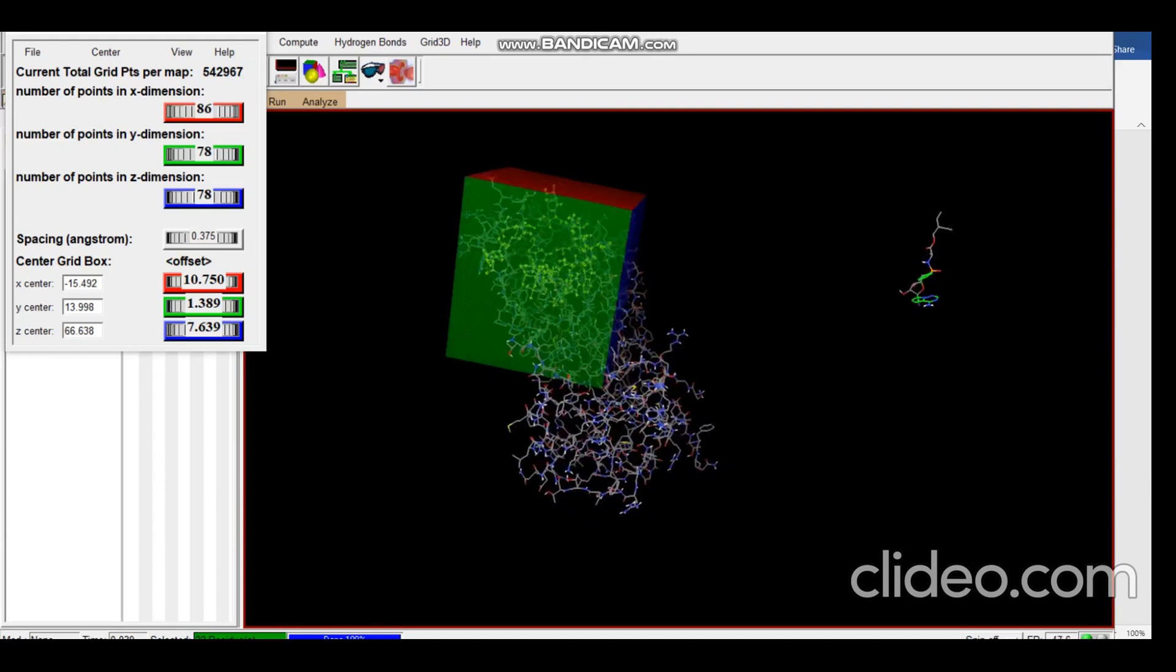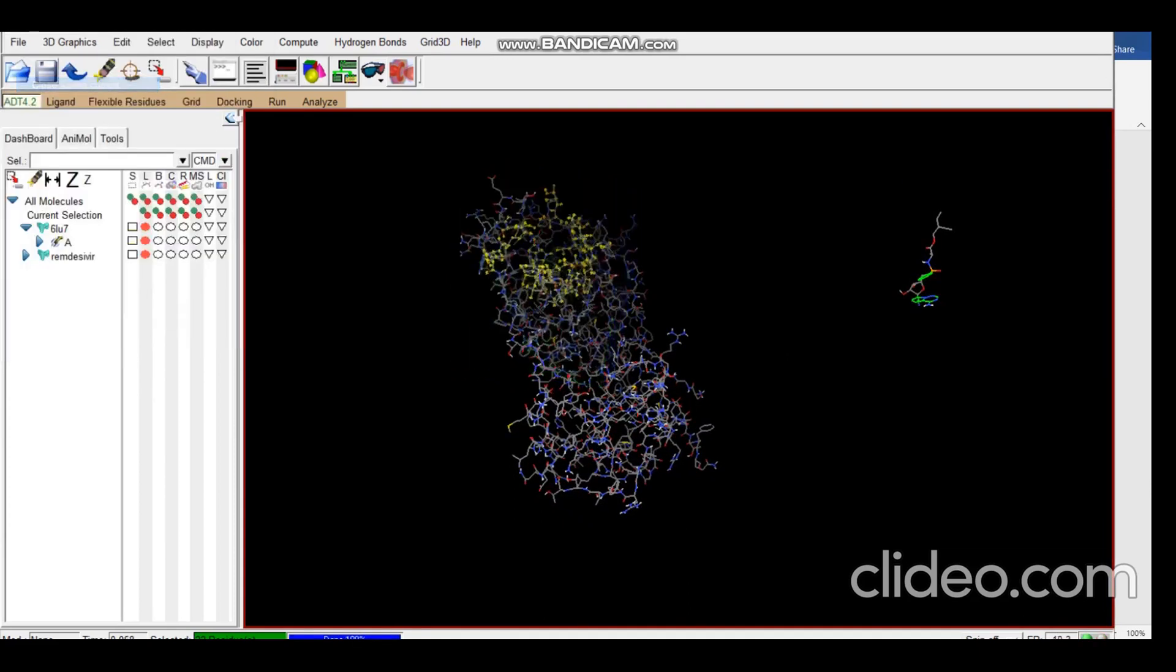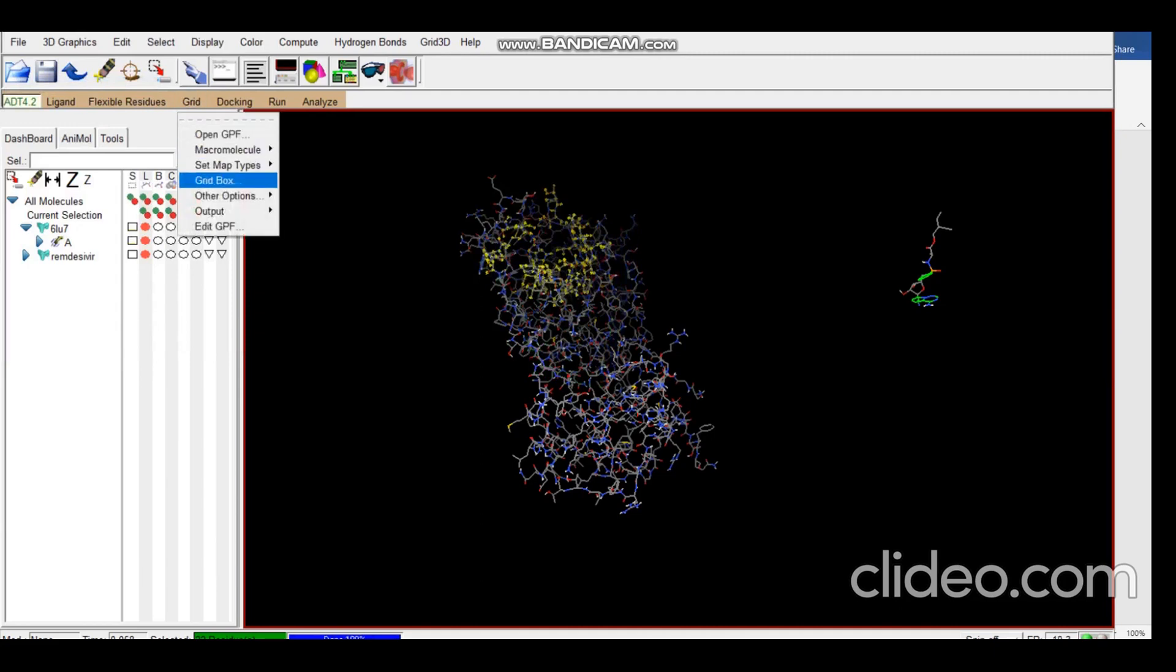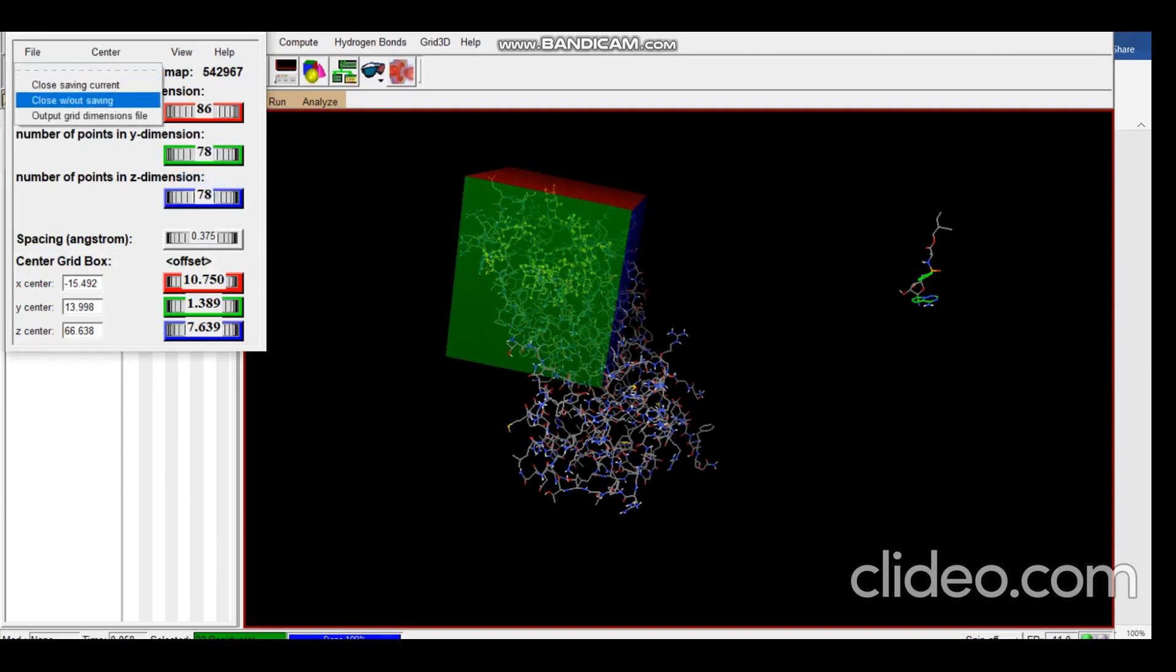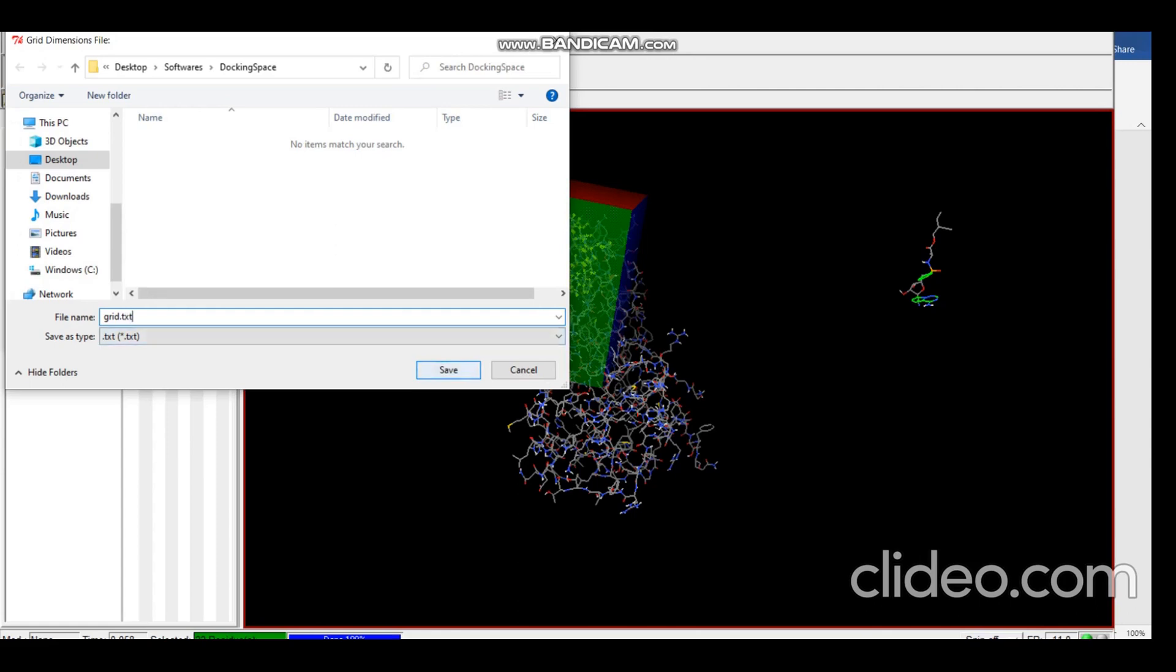So yes, let's go ahead. We will go to File and Close Saving Current. Then we again open the grid box. Now the box opens in the position that we left it in. And now we generate the grid dimension files. I will be saving it as grid.txt. You need to save it as txt.